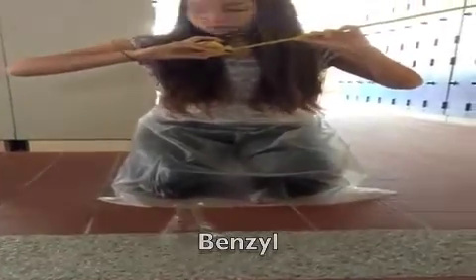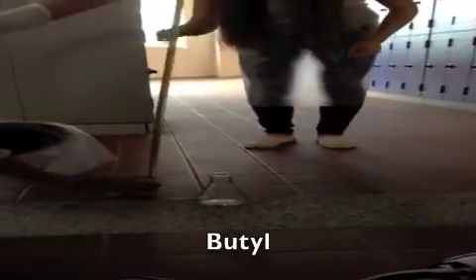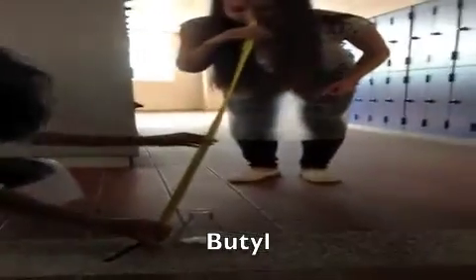And then we had a smell tester stand 10 meters away from the flask, and we removed the paraffin wax off of the flask and had the smell tester walk towards the flask until they could smell the ester. We then recorded data and repeated for all the remaining esters.